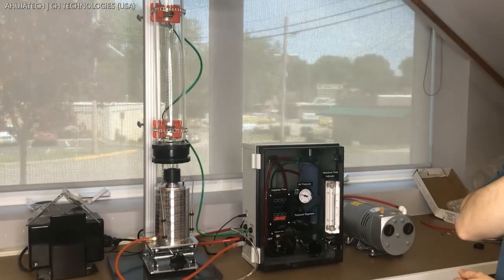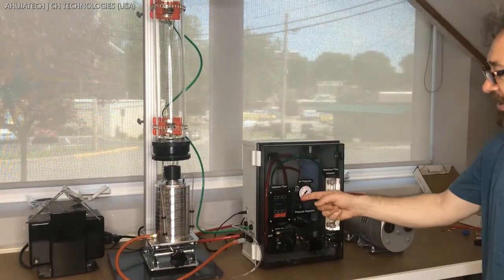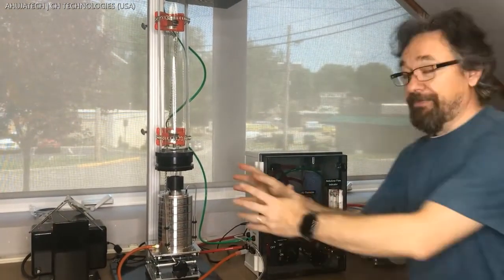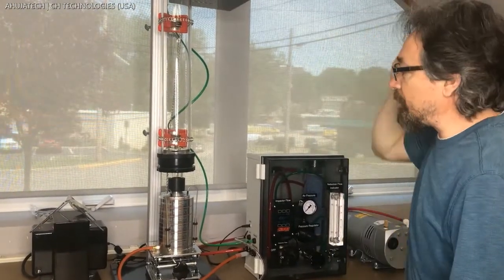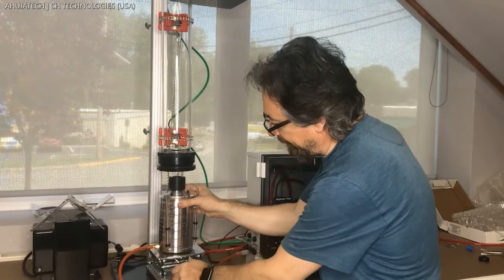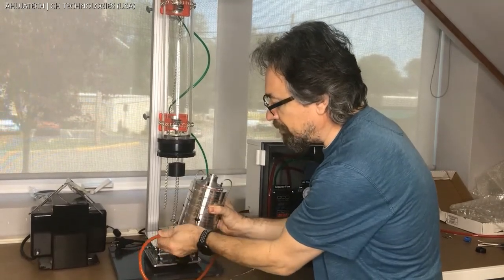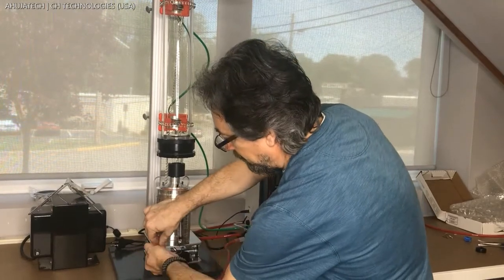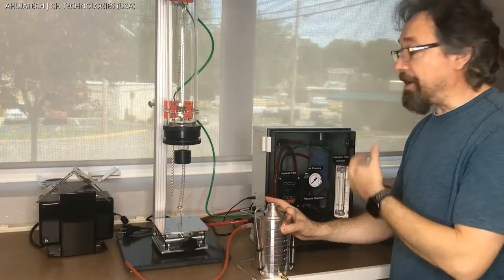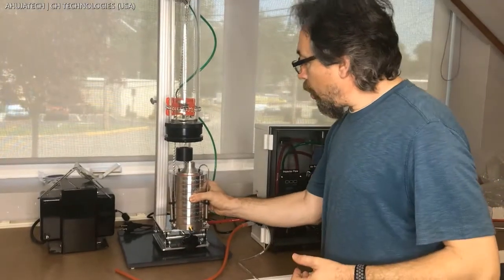Then we turn off the flow for the impactor and turn off compressed air. As you can see, the air pressure goes to zero. We unplug the pump and stop the syringe pump liquid feed. At this point we can lower the jack, pull down the impactor, slide it out, and remove the sampling line from it. Then take the impactor to the incubator, open the stages, take the plates out, and put them in for incubation. This is basically a quick startup guide for the test.